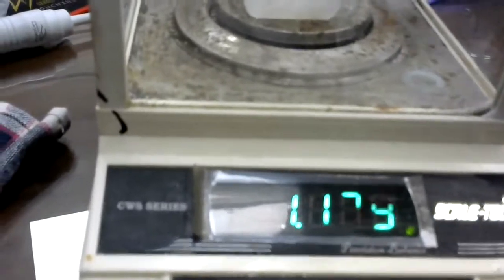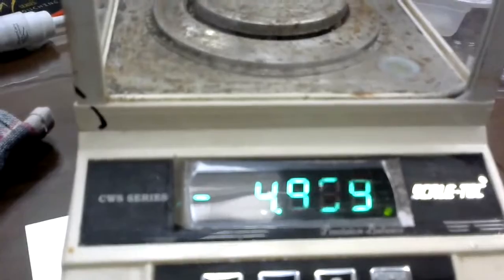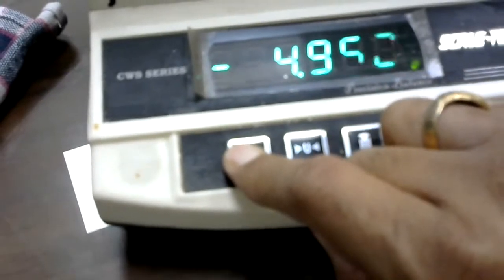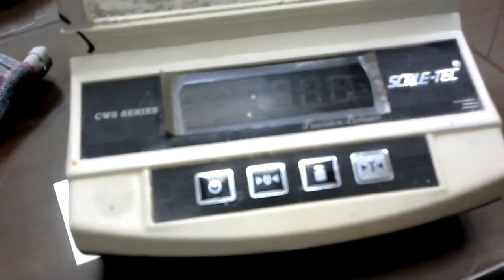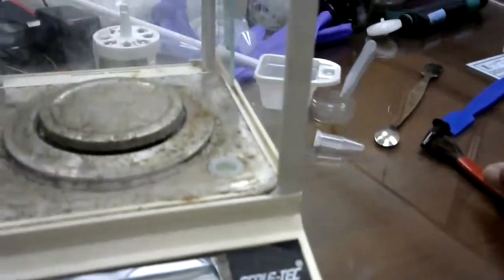After doing all these things, suppose my weighing is over, so I will switch this off. Now the balance is switched off. You can see it is switched off.